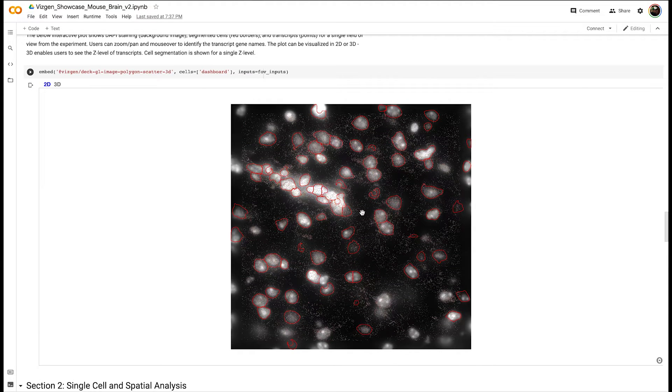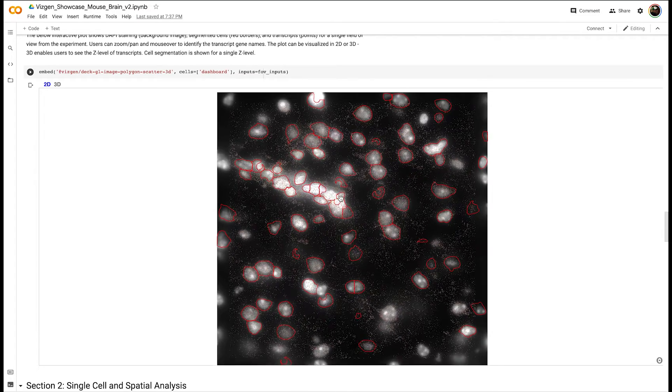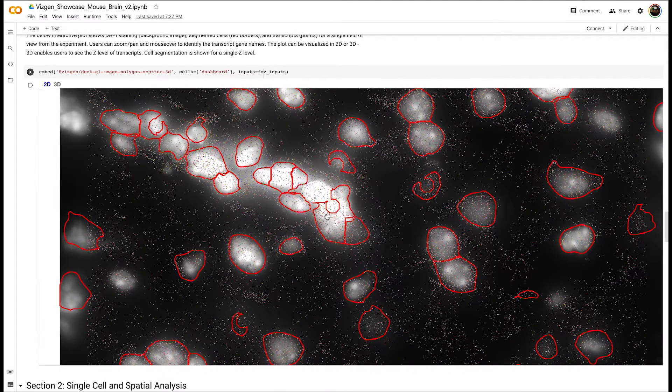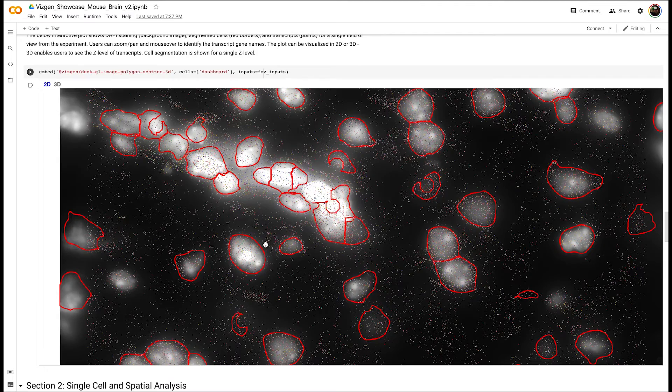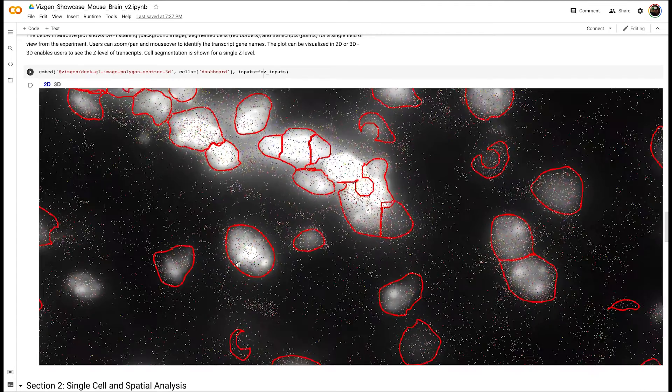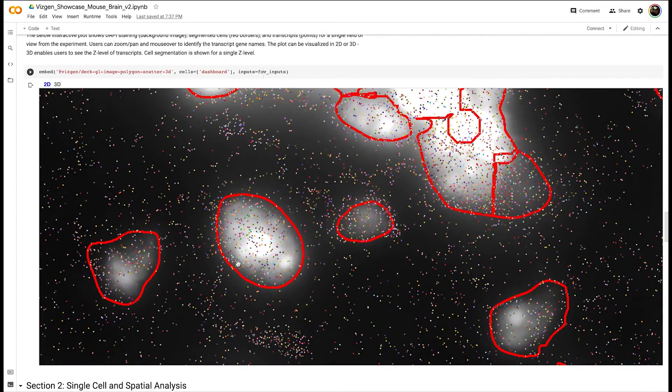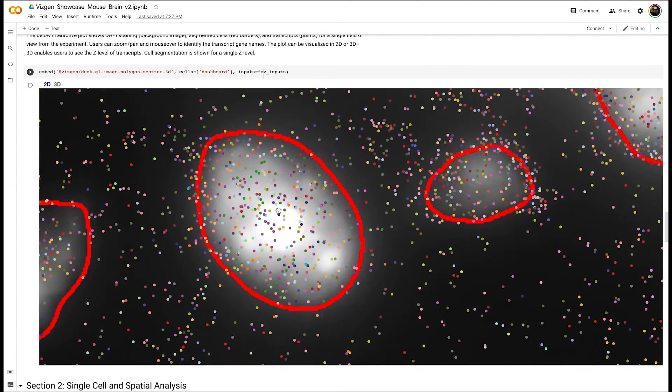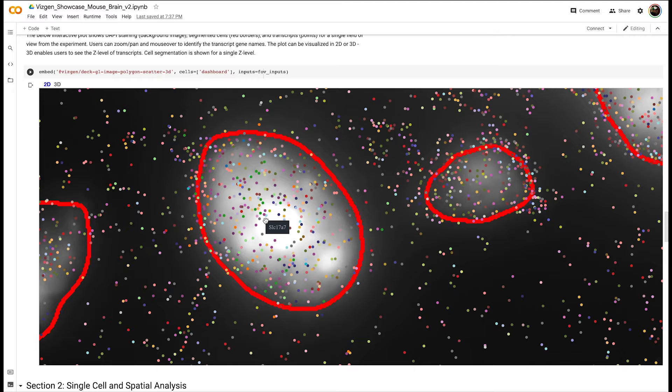Here we're visualizing DAPI as a background image, cell outlines in red, and individual transcripts as points. We can mouse over a transcript to see the transcript identity.